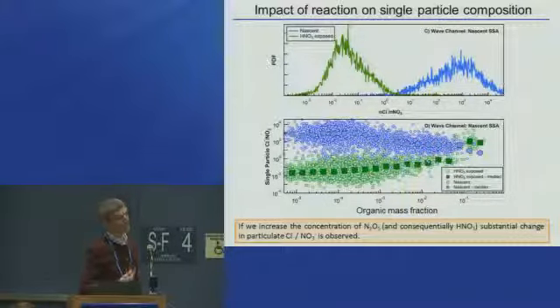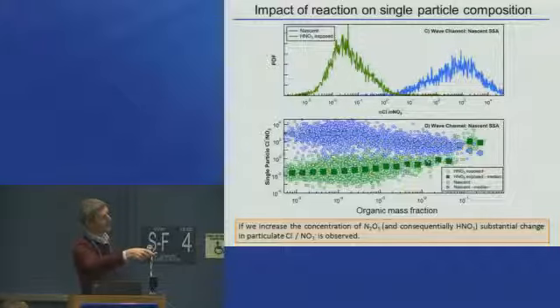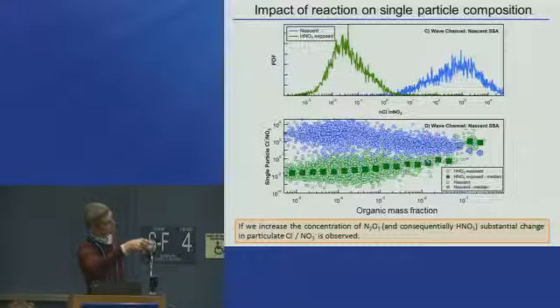So for example, in this experiment, what we were looking at here is for those nascent ones, if you're just looking at this population here, there's actually very few particles that live out in this region of having enough organic to suppress that. Most of them live out in this region, and you'd see them reacting away.